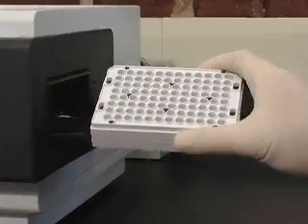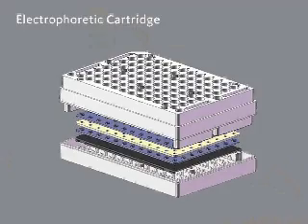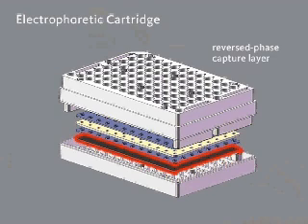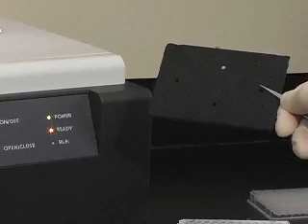The run is now complete and my samples are just about ready for mass spec analysis. I remove the cartridge capture slide from within the cartridge. The cartridge is designed to be easily disassembled into individual components. This graphic shows the individual layers of the cartridge. The analytes are captured on the reverse phase capture layer at the bottom of the cartridge. The remaining cartridge components are discarded. The slide is then rinsed to remove excess buffer salts and dried.